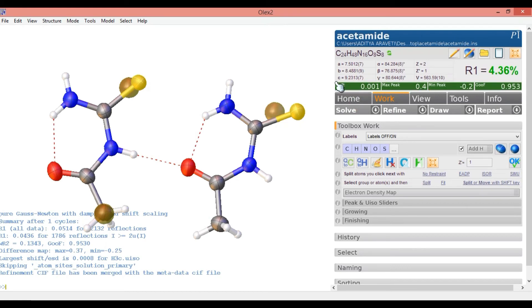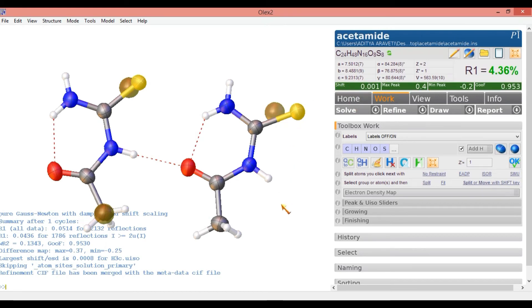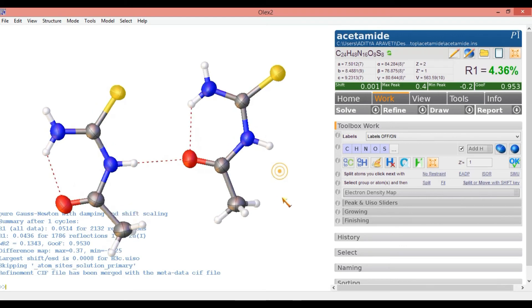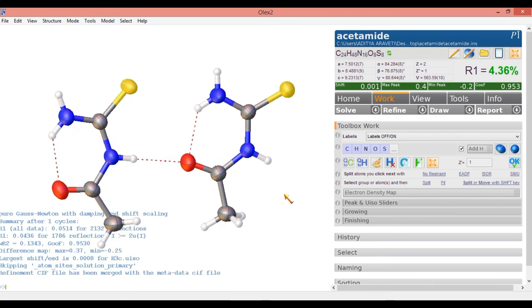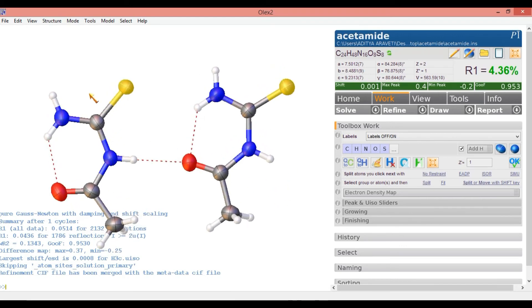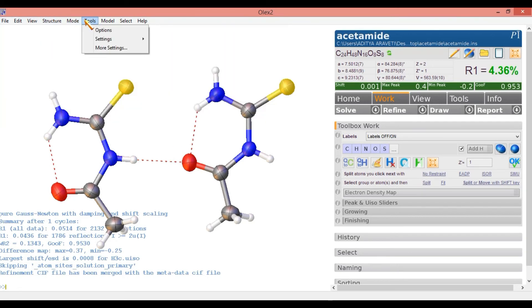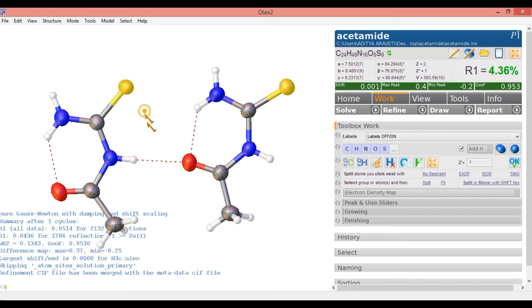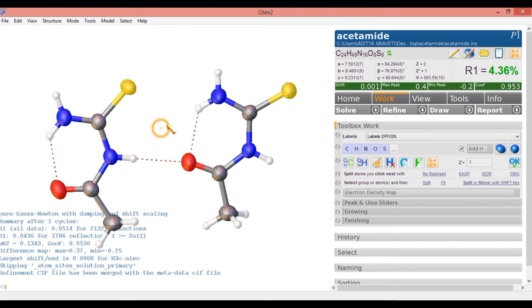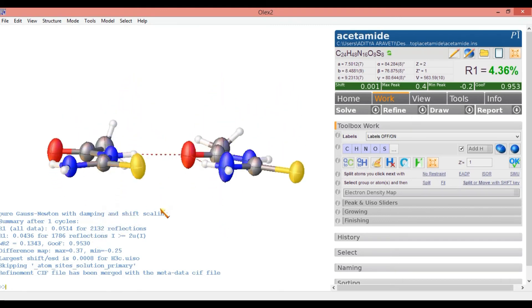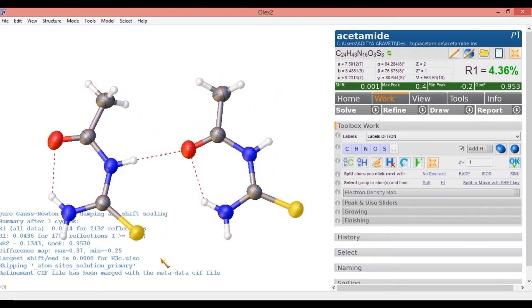Now we have got all green colors, so we have got the exact structure. We can save it, take a screenshot, or extract the graphic. From the tools we can extract this graphical structure also. Now you can understand how to solve a crystal structure.